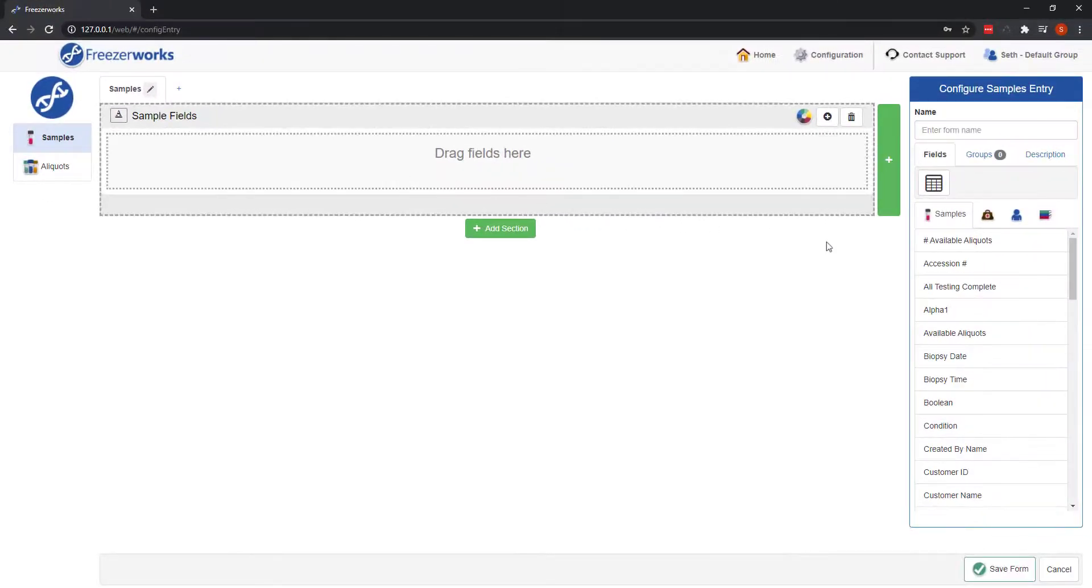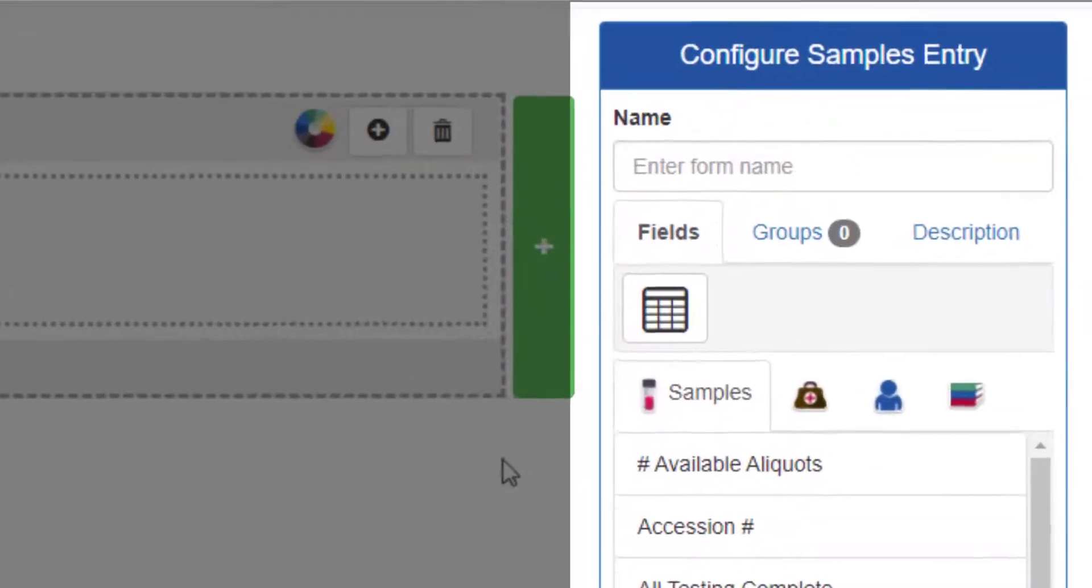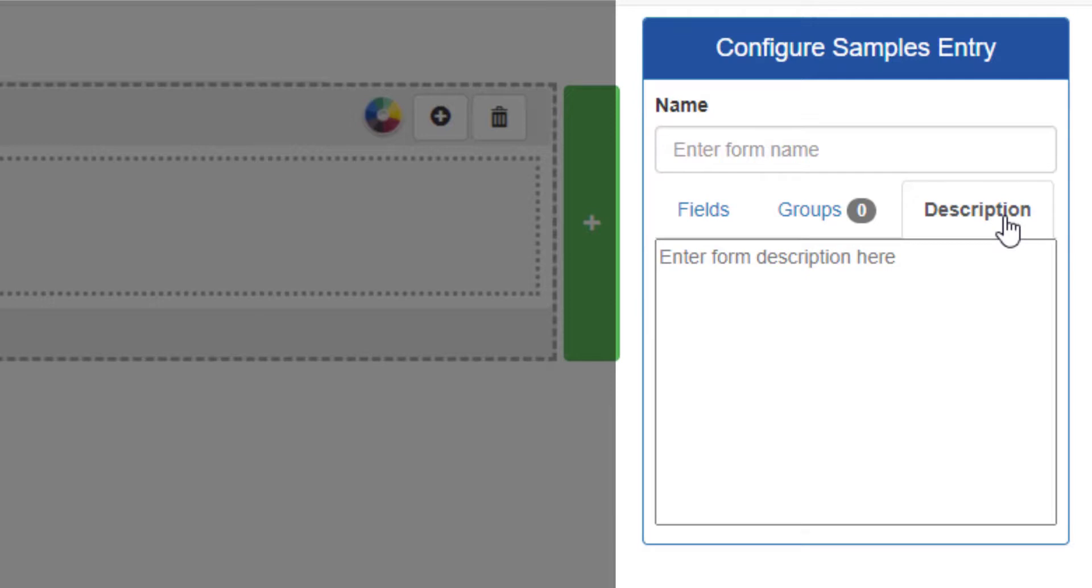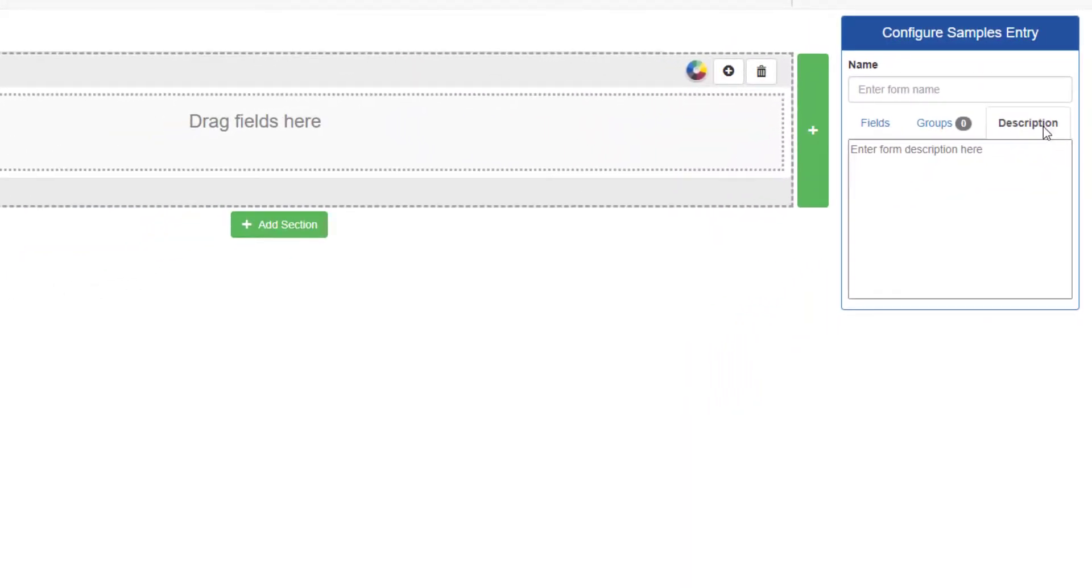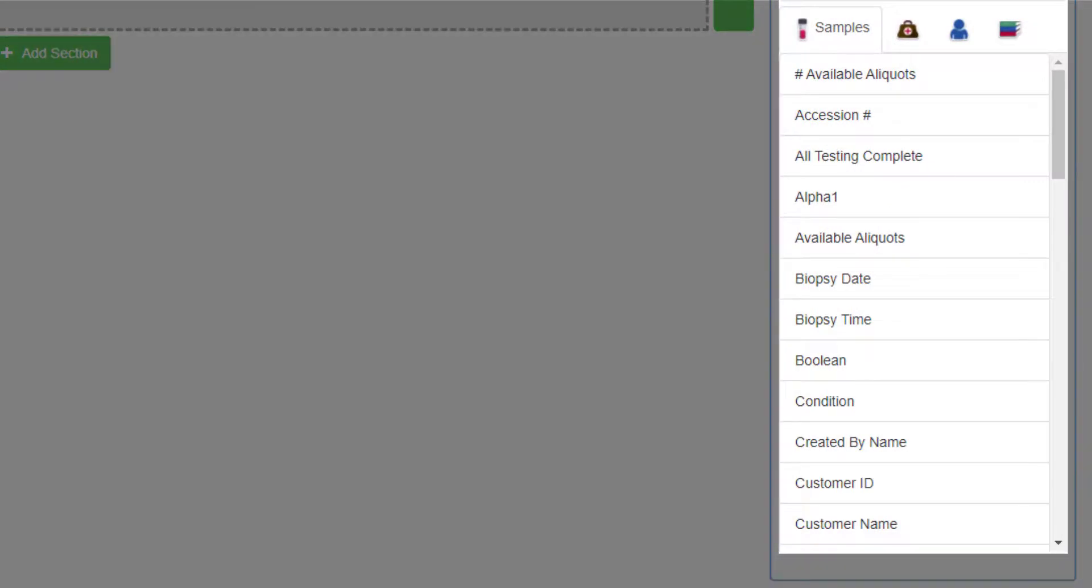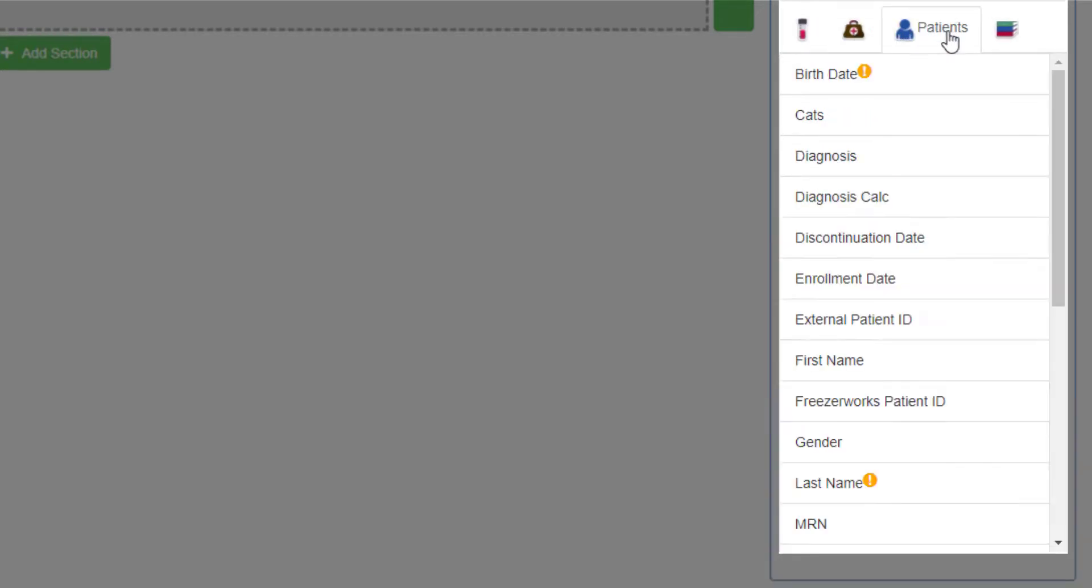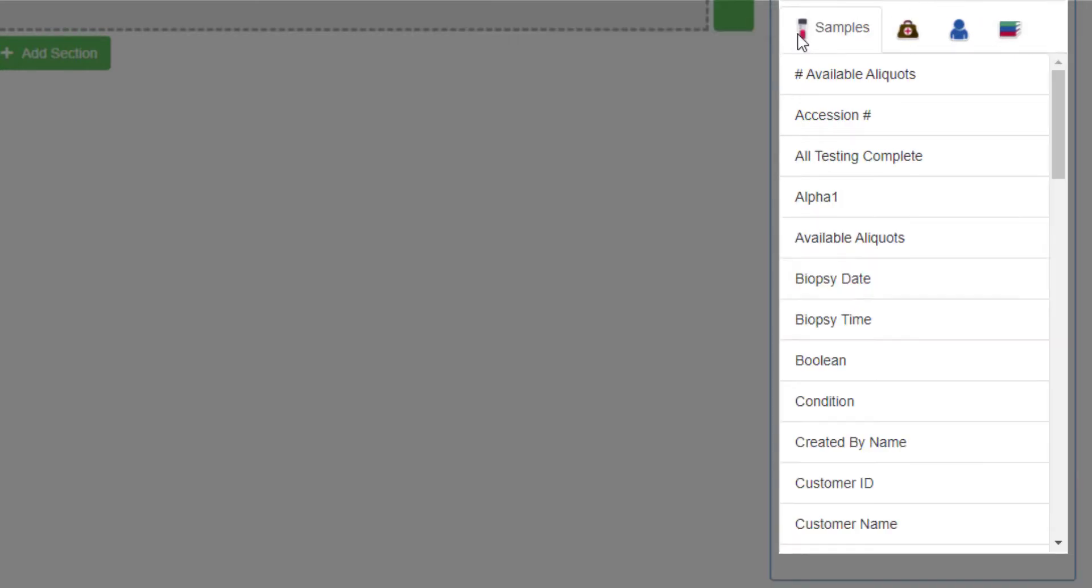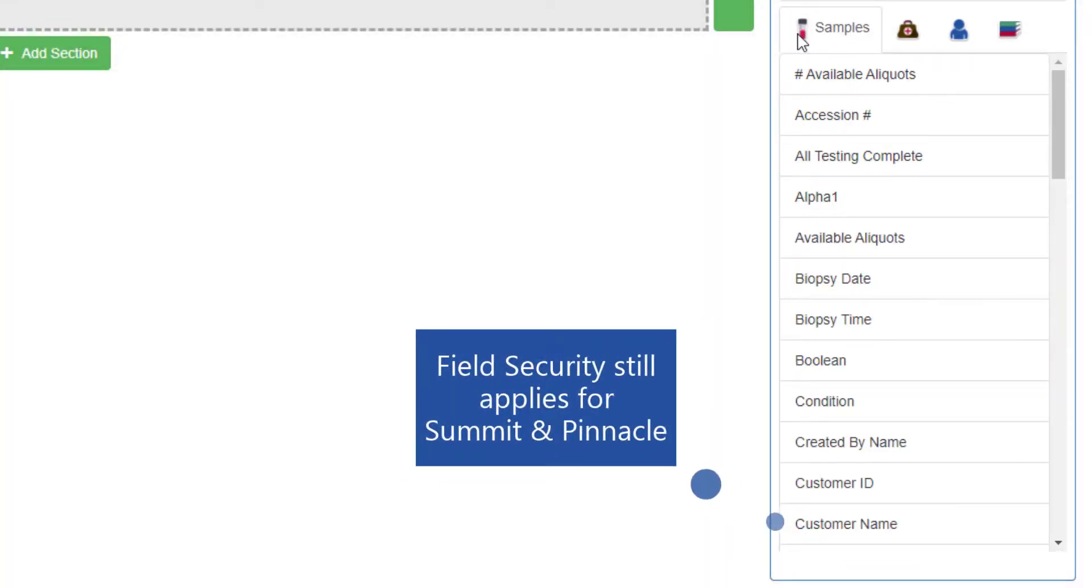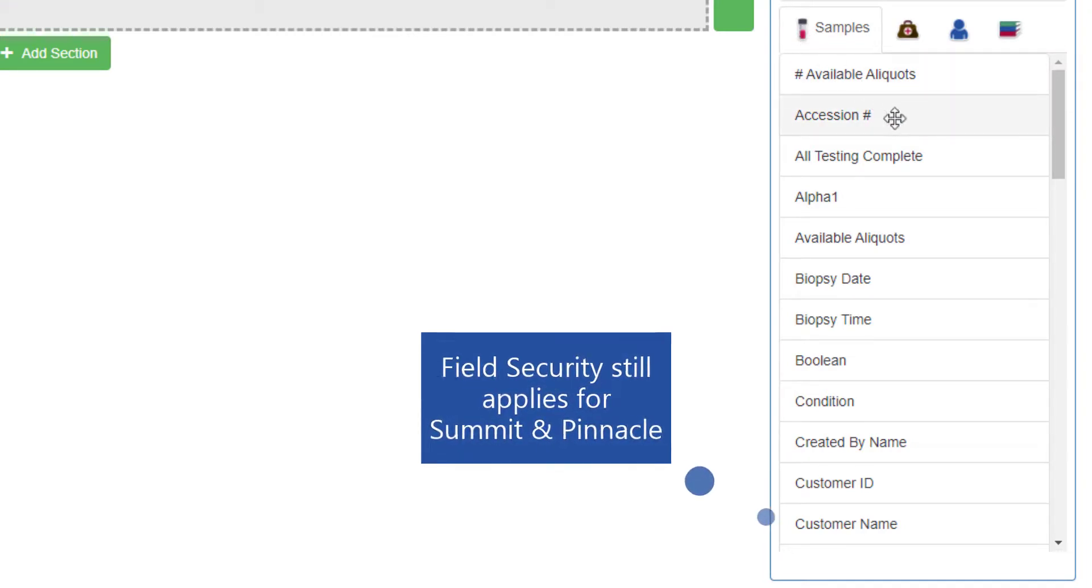On the right side of the form, you'll find the palette. This is where you give your form a name, assign it to groups, and provide a description of the form's purpose. Most importantly, though, the palette is where you find all of the possible fields you can add to your entry form. And if you have Summit or Pinnacle, you will have multiple tabs of fields from the different data tables: samples, visits, patients, and studies. Otherwise, you will only have a samples tab. Every field will be available to add to the form.